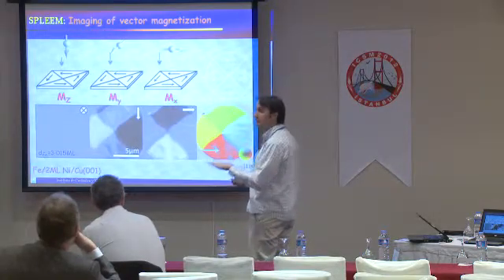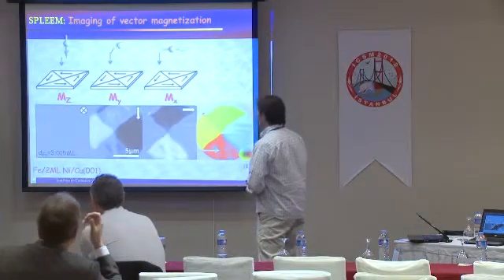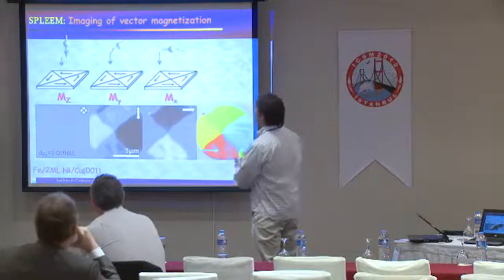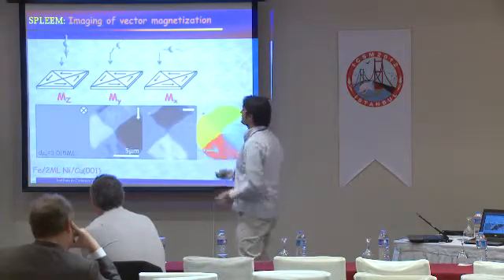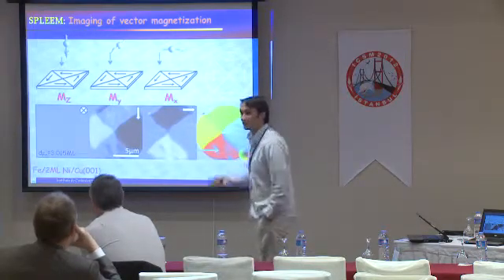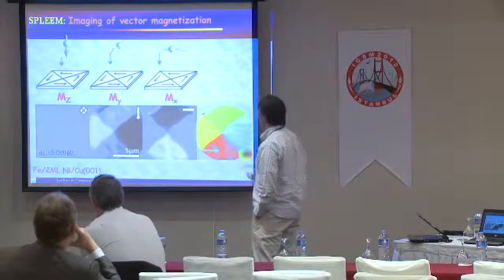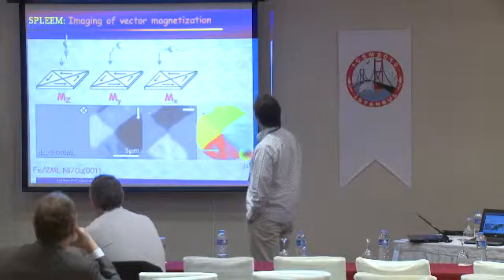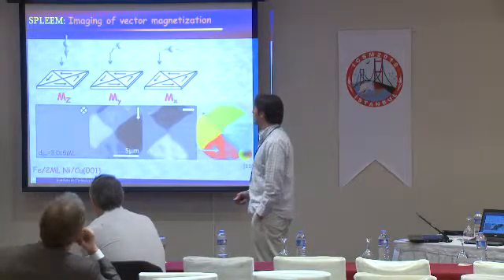Here we have an in-plane magnetized sample, this system here, with a vortex state here. And when we probe the sample with electrons polarized normal to the surface, then we see no magnetic domains because the magnetization is in plane. And then by taking 2 orthogonal images from in-plane directions, one is able to map out the 3D domain structure of the system.